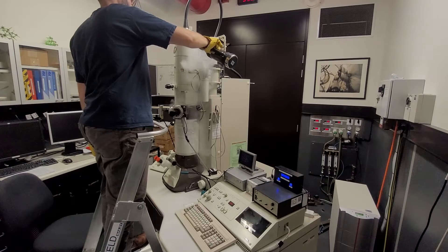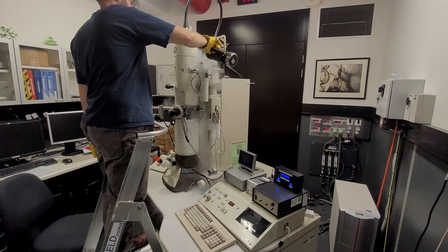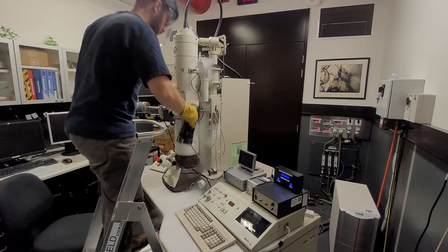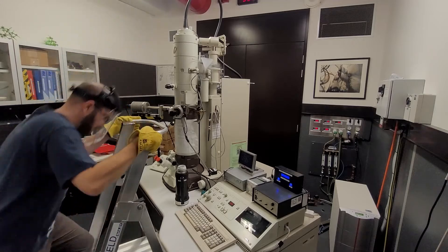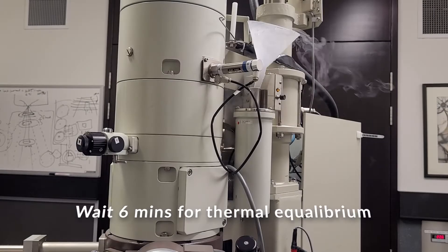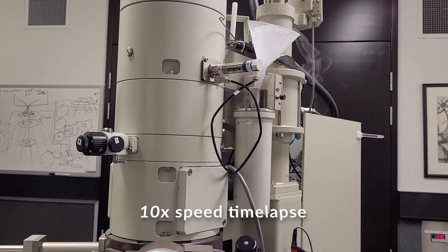Fill the cold trap roughly two thirds of the way full. You'll now need to wait six minutes for the cold trap to reach thermal equilibrium. This is a ten times sped up time lapse.